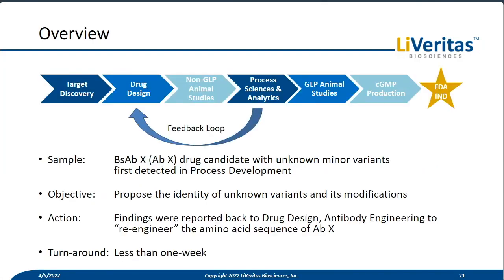We were approached by a biotech startup as one of our clients, a very important client, with very exciting scientific questions. The sample presented to us was this bispecific antibody drug candidate. Let's call it Antibody X. It has unknown minor variants that were first detected in process development.